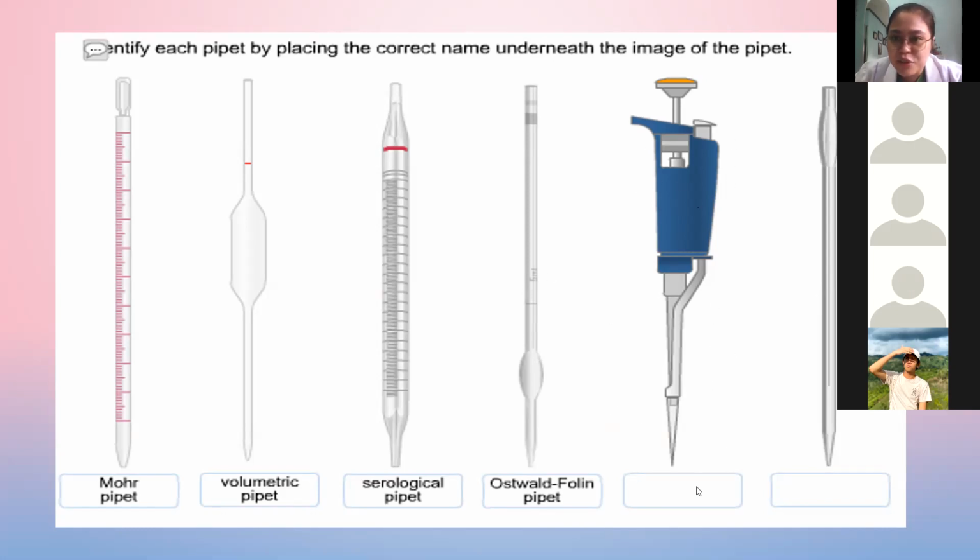And then what do you call this pipette? Wala gisulat ang pangalan. Say tawag ani gani. And then kaning last. Eppendorf, ma'am. Okay, this one kaning blue is the Eppendorf pipette. So this is also known as the micropipette. Gina-connect siya sa tip like this one. And the last one, tama na siya like the last one, kani siya, is the lambda pipette.